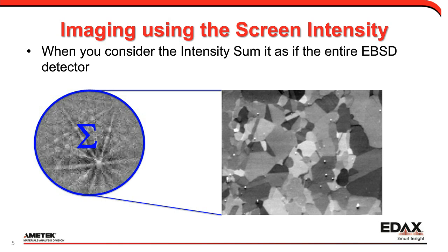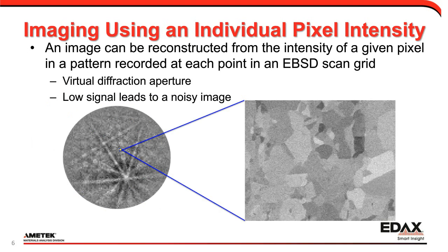The opposite extreme is to use a single pixel for the virtual aperture. The advantages are easy placement, many possible selections, and potentially high contrast. The disadvantage is that the signal may be so low as to void any benefits. This option is not too useful in practice.